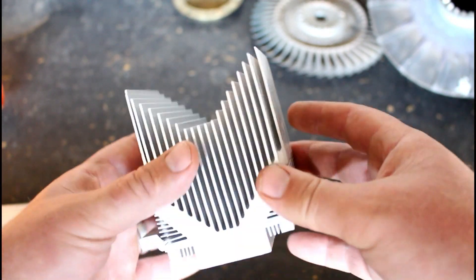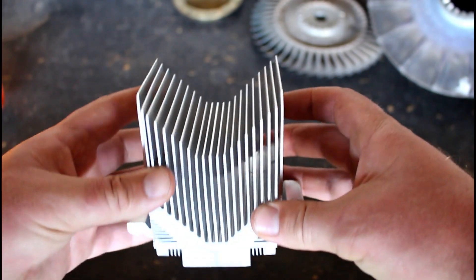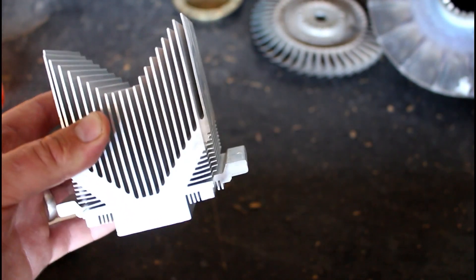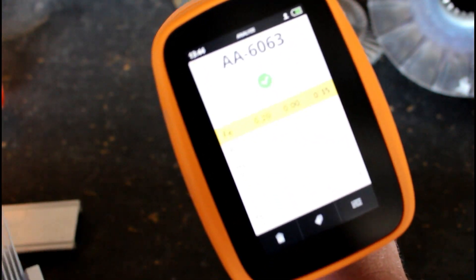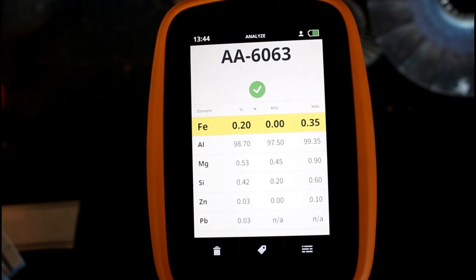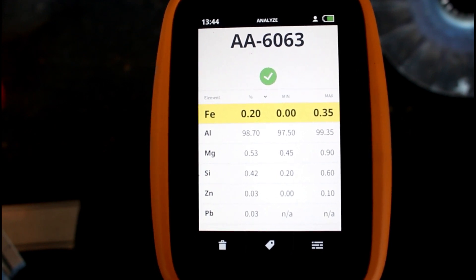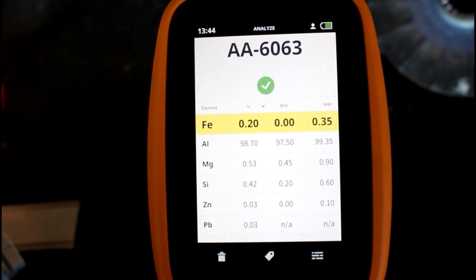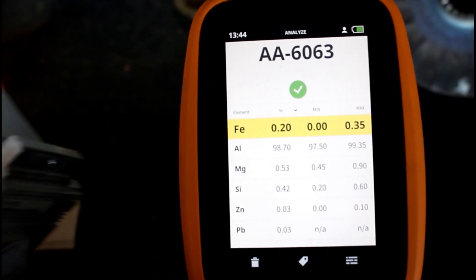We're gonna shoot this piece of aluminum first. If any of you have seen my other videos, this is a heat sink that goes inside a computer — sits on top of the CPU. Watch how fast this sucker is. Done. So we just shot it, took like a nanosecond — just kidding. We shot it and it gave us aluminum 6063. So this is 6063 aluminum.